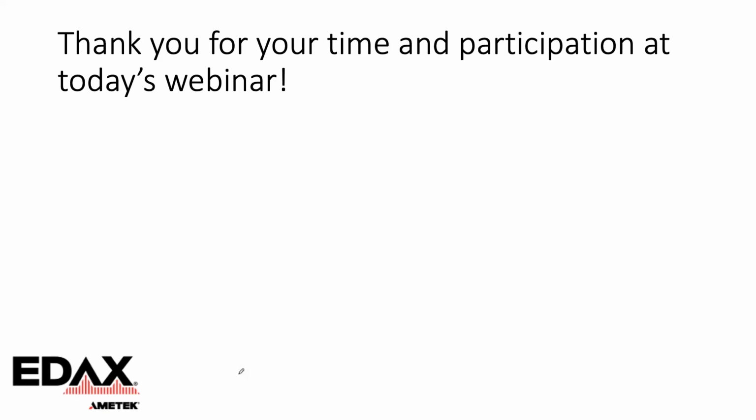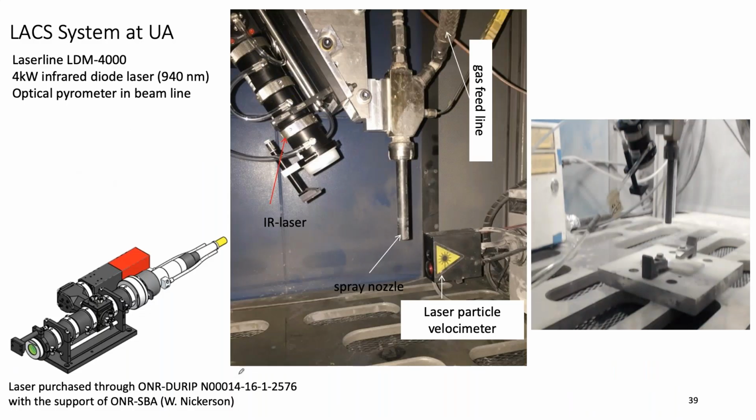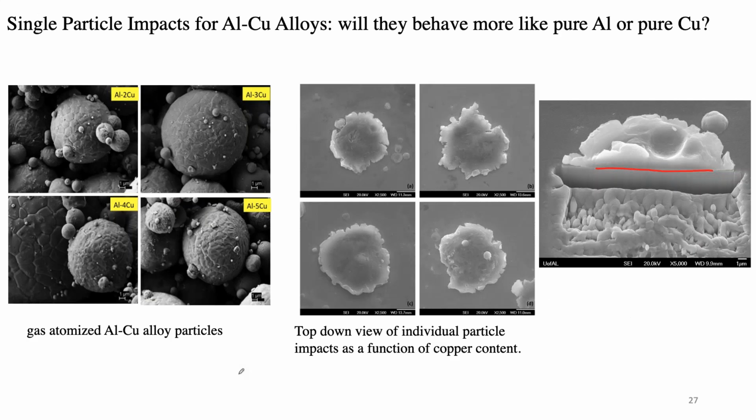How thick is the thinnest ceramic substrate you think you can coat, and what is the thinnest possible coating that you can achieve? Okay, so let's do those in reverse. So the thinnest possible coating, in a sense, it's set by the powder particle size, right? So our powder particles are somewhere between 10 to 40, 45 microns in size.